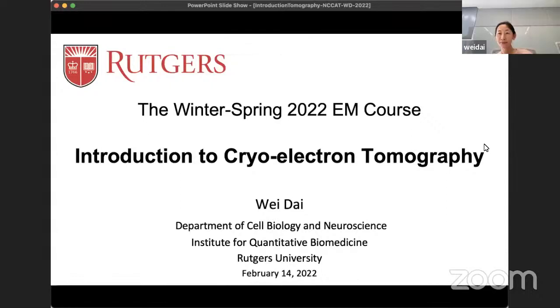Okay, thanks. So I'm trying to figure out how many students are in this session with me. I'm happy to give the opening lecture on tomography. The title will be Introduction to Tomography. The purpose of this lecture is to introduce to you the fundamentals and also language in cryo-electron tomography, so in the future, you can make an educated decision if this bioimaging tool is useful for your research.